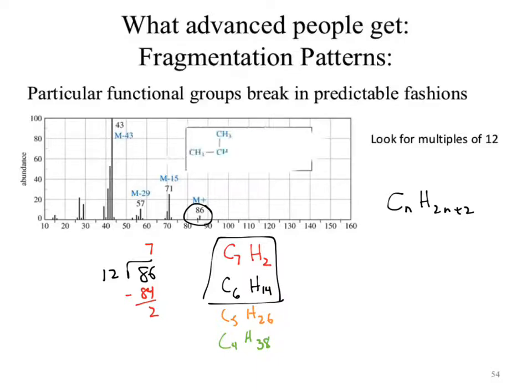Because someone was kind enough to actually draw in the answer, or walk back out the door so we could magically have that appear again. How many carbons in the structure? 6. How many hydrogens? 14. Hallelujah, it matches.